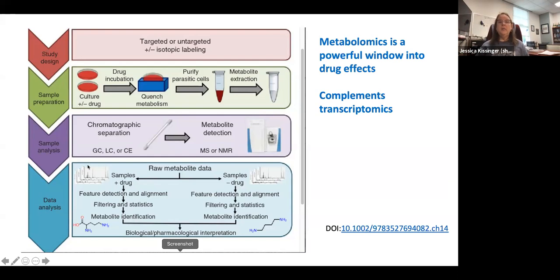You look at mass spec profiles in the end, and you identify metabolites, or levels of metabolites, that are different between your conditions. It's a very nice way of trying to get at the phenotype of what might be going on in your system, and it's a really valuable data set that can be integrated.